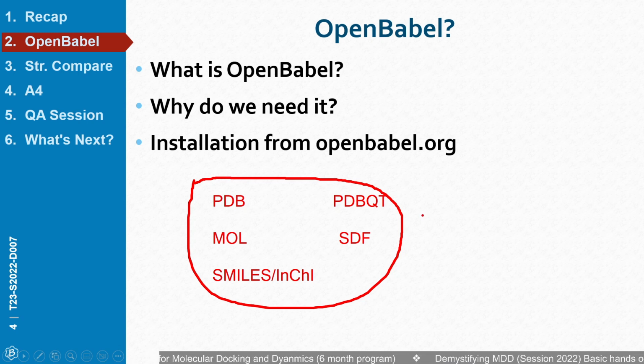And later on, more complex, in PDB format we saw that those residues are grouped as chains, and any software or package treats a group as a model. And in ChimeraX or PyMOL, if there are multiple files, you will be interacting with them individually using some options on your system.